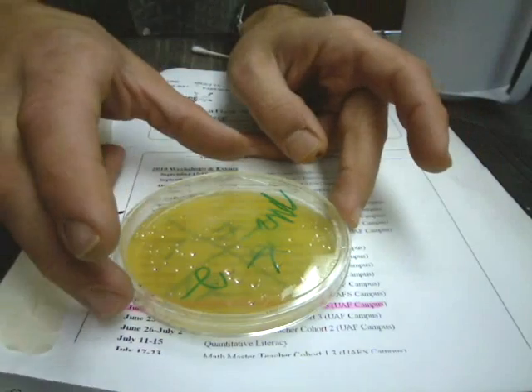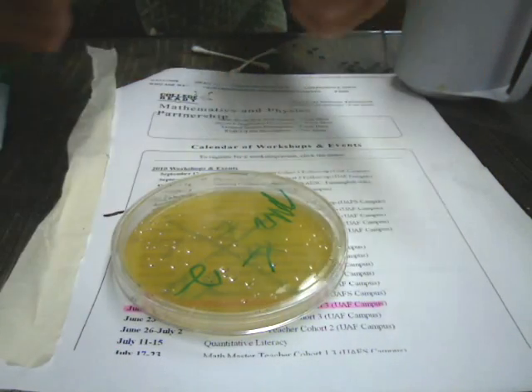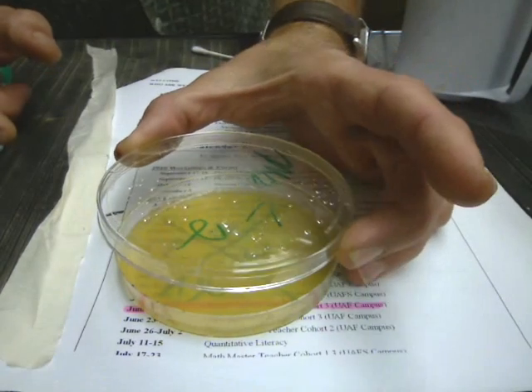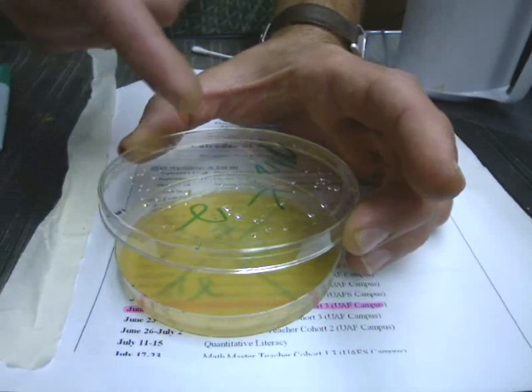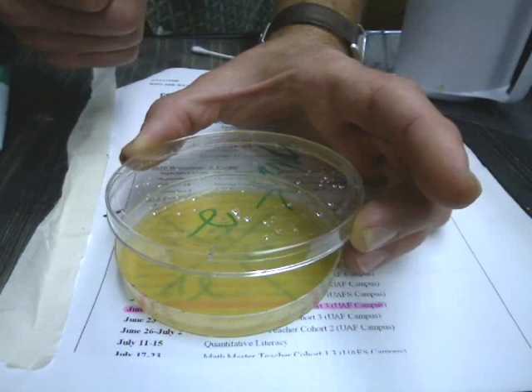Now, when we're using the plate, it's important to remember that gravity is constantly pulling mold spores down, so when we're applying things, you want to lift the lid but keep the lid over it, kind of like an umbrella against mold spores. This is really effective at actually keeping nasty stuff out. You'd be surprised how effective it is.